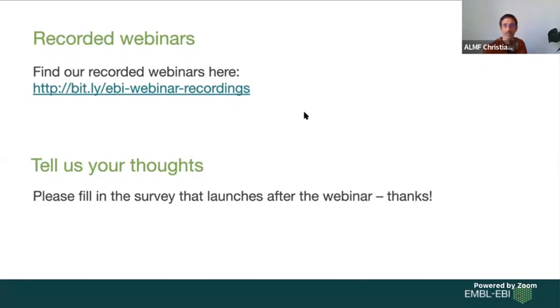Okay, Risa, which softwares or plugins in Fiji would you recommend to use for segmenting, tracking, moving objects in videos? Yeah, so if it's round, okay, so in Fiji, for tracking, I think there is a kind of easy answer. There is TrackMate. And if your objects are sort of dots, then you can also use TrackMate for segmentation. If they have a shape, then actually you would like to do the segmentation outside of TrackMate.